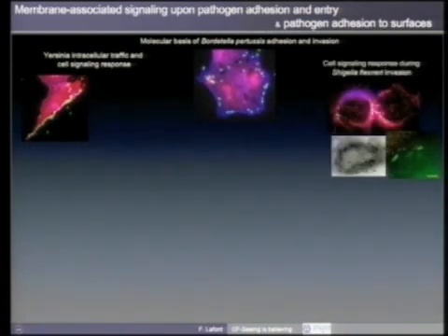And just to please Jost, here you can see the recruitment of GAL3 on bacteria. So this is live imaging on host-pathogen interaction, and also studying their entry.